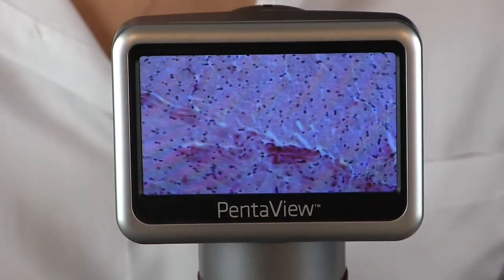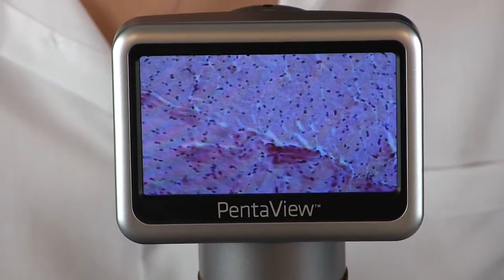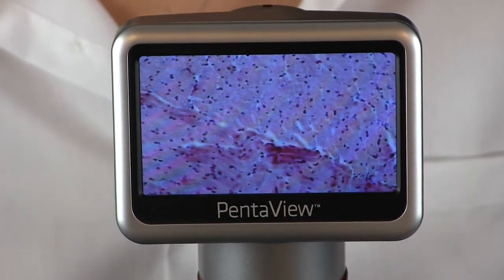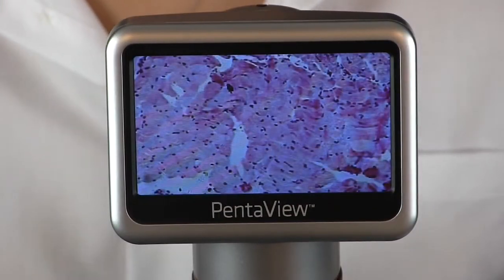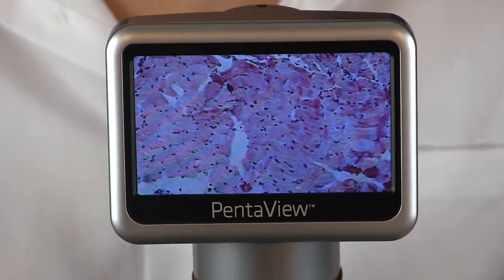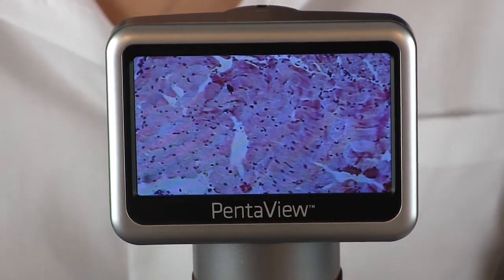So we're going to get a different slide that we can take a look at some cells on. We've zoomed in on some muscle cells. Each of these dark dots is a nucleus of a cell, which has the cell around it. Isn't that cool? Here's another section of that same slide. Remember, muscle cells are long and thin — that helps them to do their job.